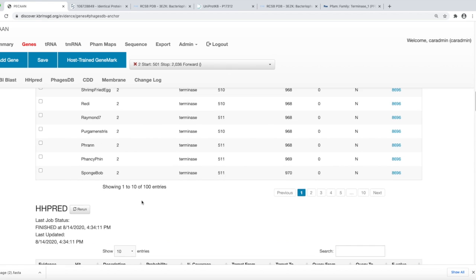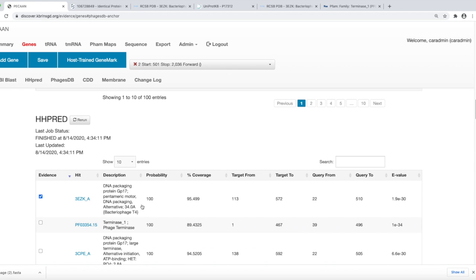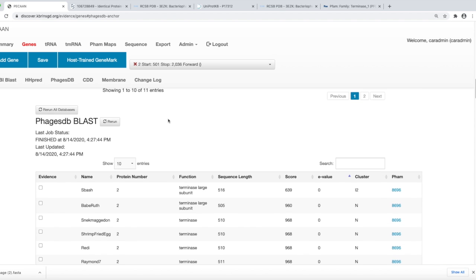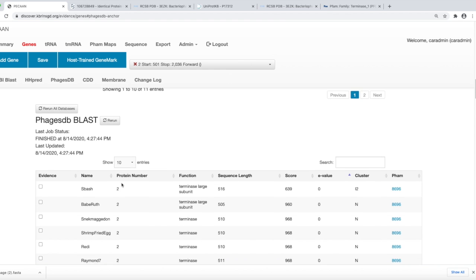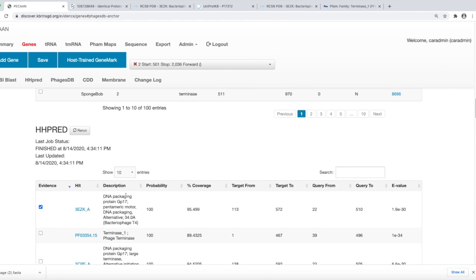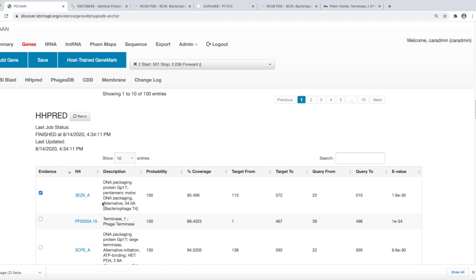Below this is the HHPRED where PhagesDB BLAST and the NCBI BLAST are comparing nucleotides to the database. The HHPRED predicts the secondary tertiary types of structures of the amino acids and compares that to structural types of databases.